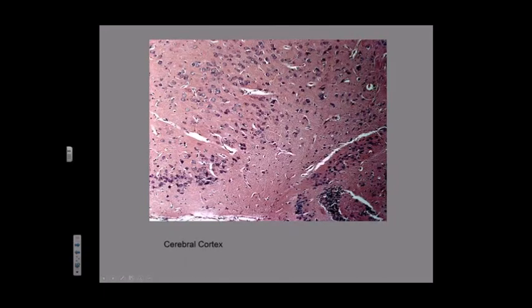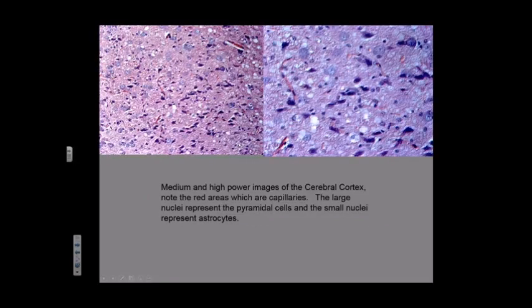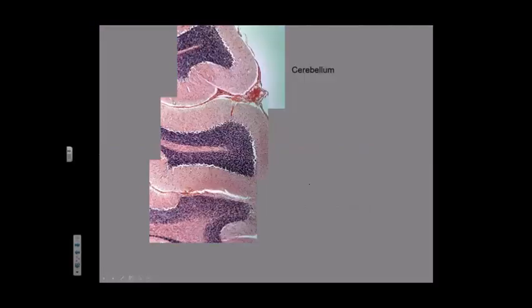Here it is under higher power. That's it. Again, even higher power, and even higher power. You can see here, I go one of these holes. They're not holes. They're capillaries. Okay. Here's one cut in kind of like a longitudinal section. Okay. Those are capillaries. Now we were looking at the cerebrum.